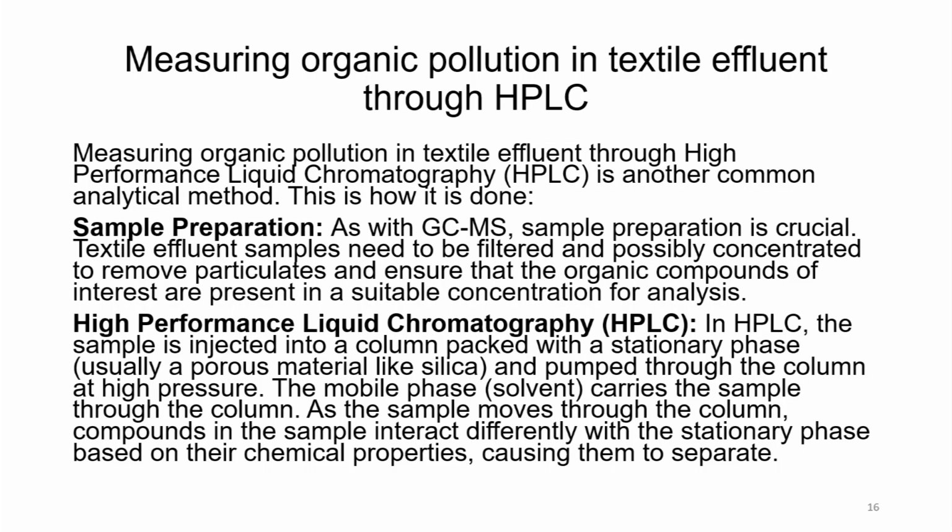Sample preparation. As with GCMS, sample preparation is crucial here also. Textile effluent samples need to be filtered and possibly concentrated to remove particulates and ensure that organic compounds of interest are present in a suitably concentrated material which will be used for analysis.